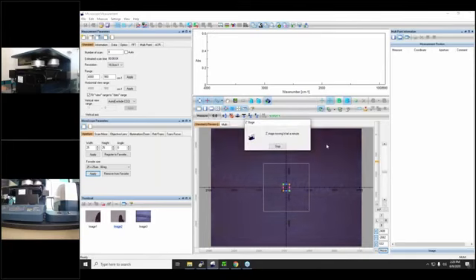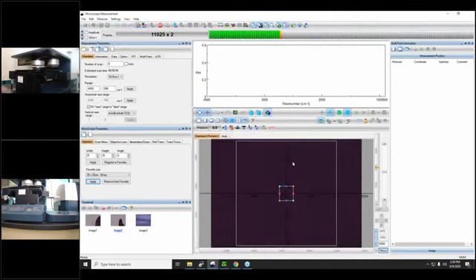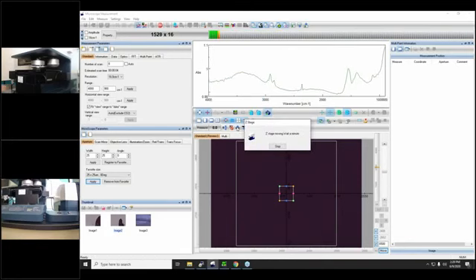So what we're going to do is look through the crystal. The stage is going to be lower, just for safety, so as not to damage the crystal or the sample. We change the optical path, and what I'm going to do now is just raise the stage.